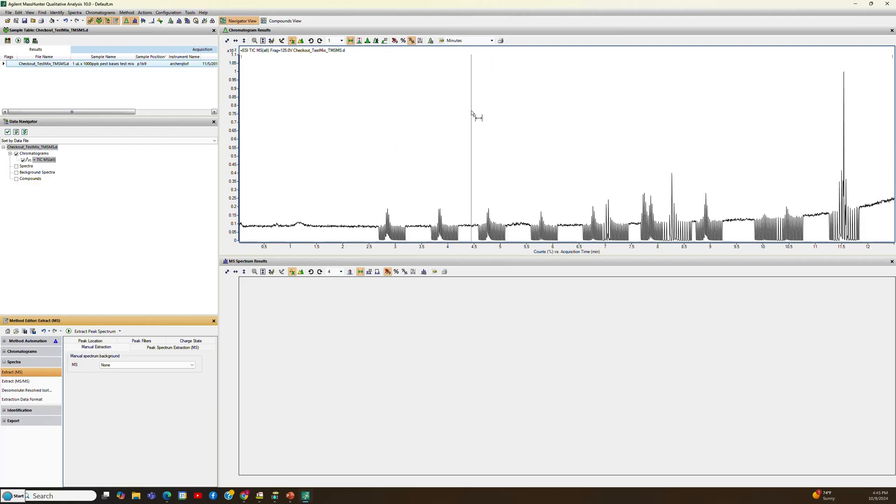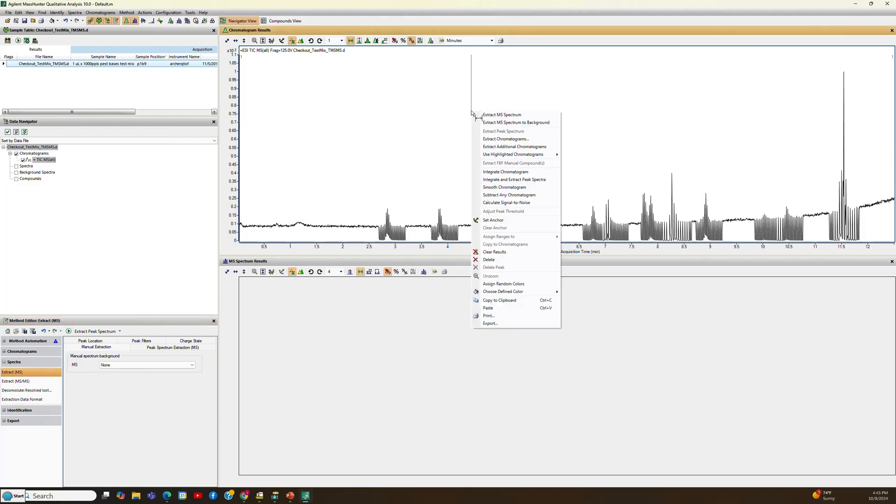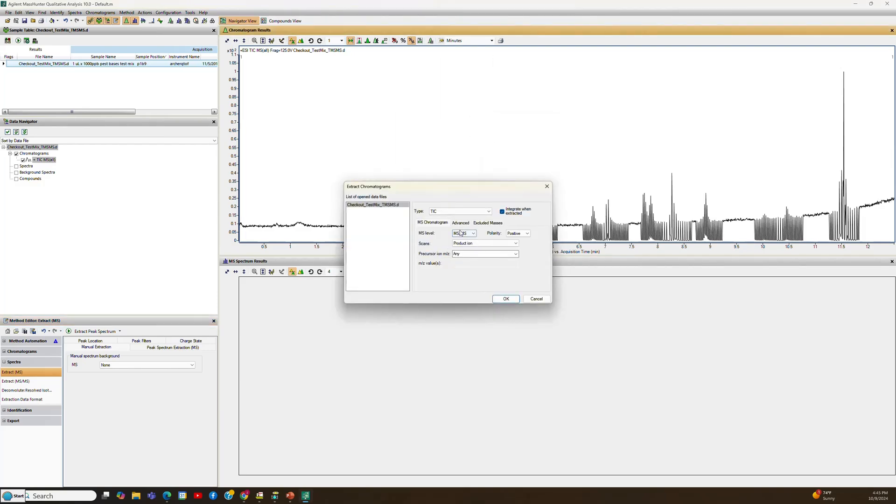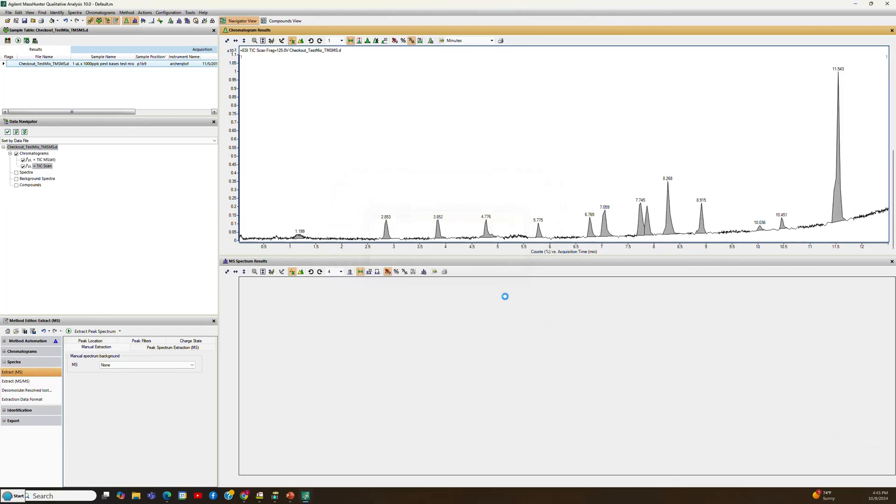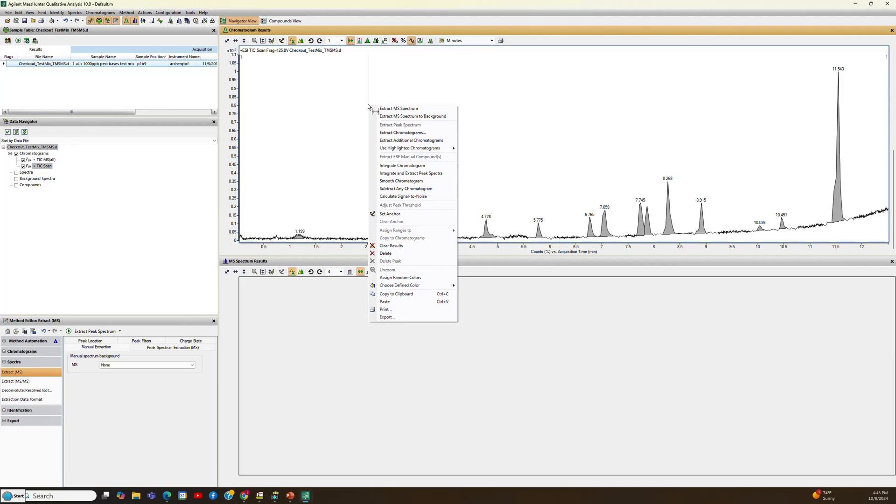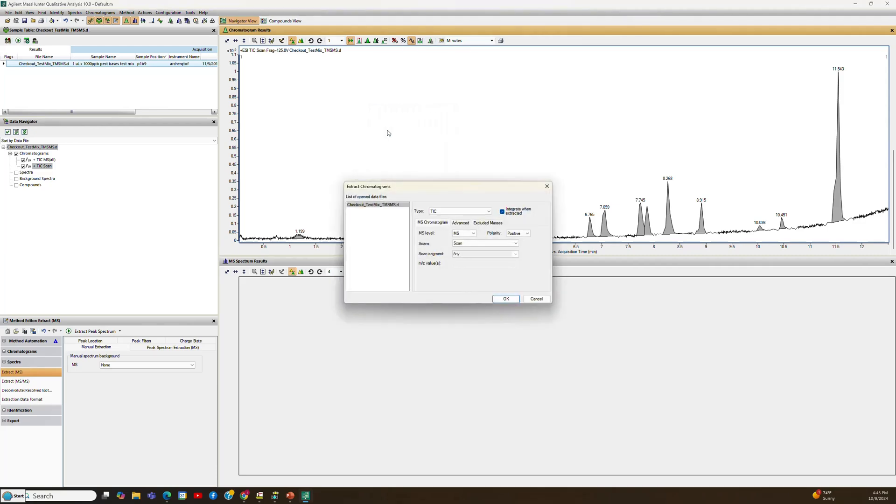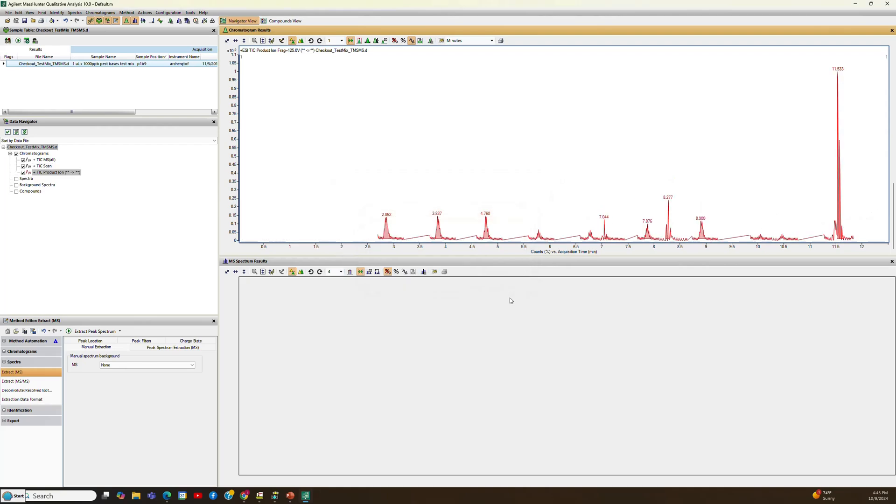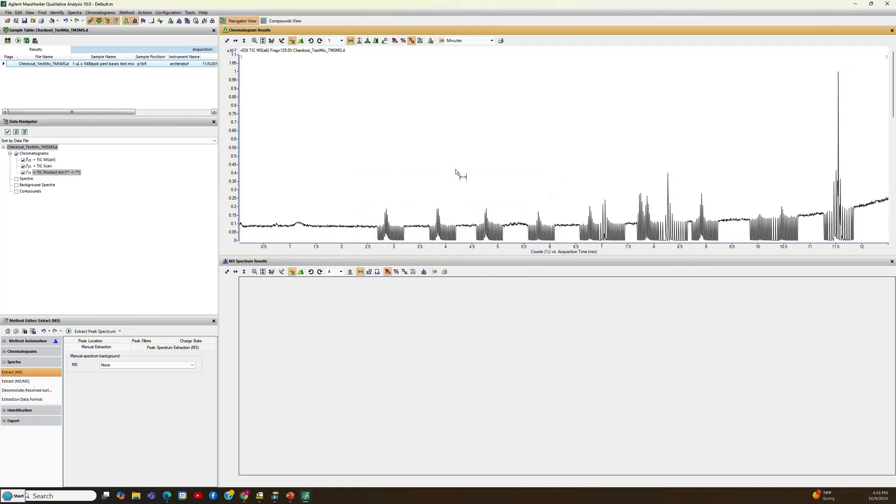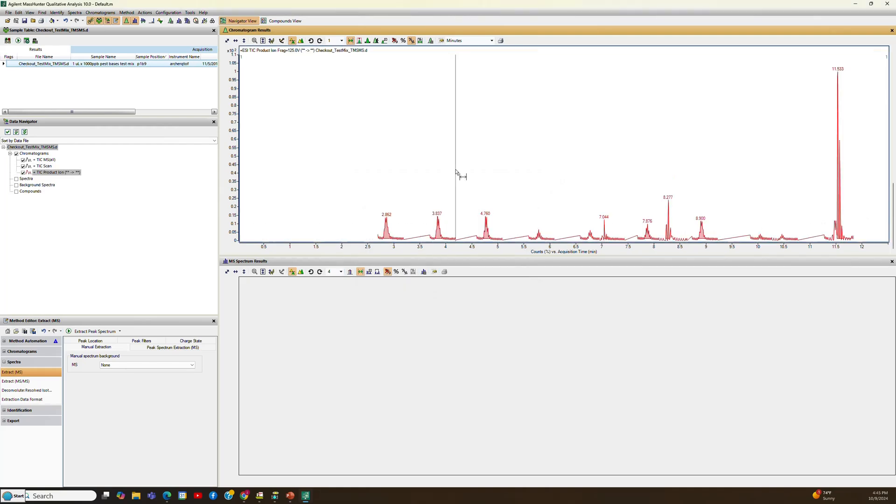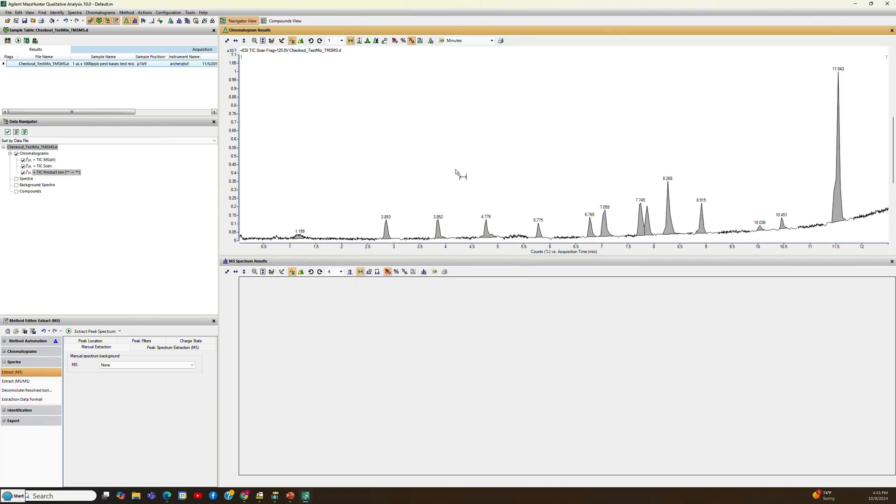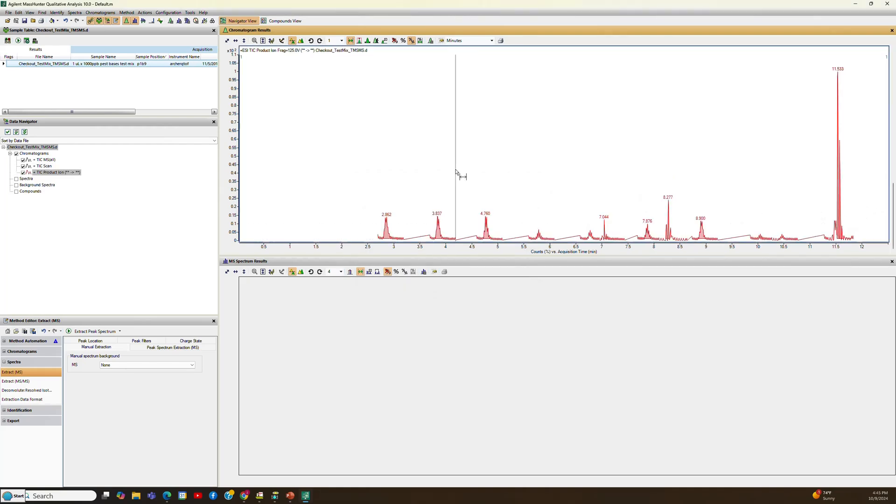So the first thing you need to do is extract the chromatograms, so we'll go to this menu, and go and extract the MS, which is zero energy, and then we'll also extract the chromatograms for MS-MS. And so now you can see they're all stacked together, so I can see all three.